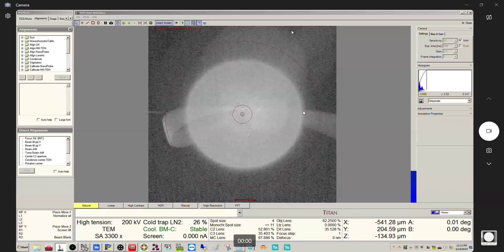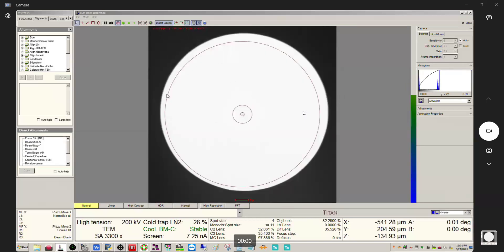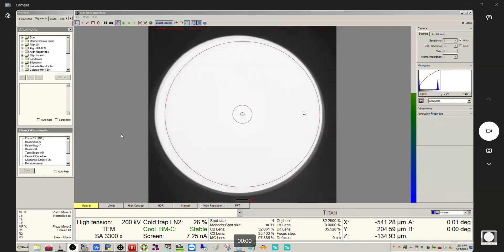We can see the beam shift was still off, so we click 'Beam Shift' and the beam comes right back. Remember: if we were not over a transmissive area, we still wouldn't see anything after clicking beam shift — we'd still need to decrease the magnification. For convenience, you could click beam shift first and then decrease the mag as well, just to rule out the possibility that the beam shift got out of whack in addition to being over something non-transmissive.